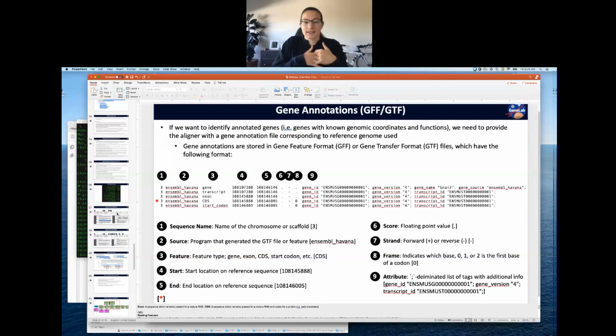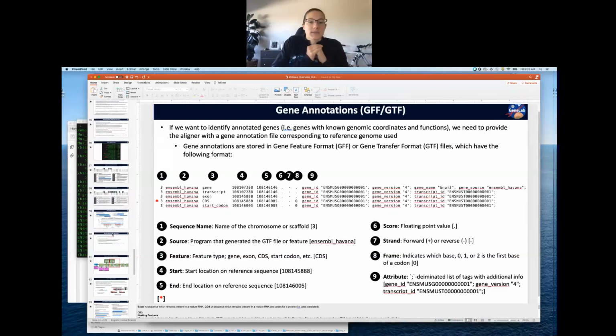Any guesses where we find that fragment length? Yes, Inru, the SAM file. And do you know what specific SAM file, since we're looking at isoforms and need to know the weighted isoforms? And of course, isoforms are the different transcripts that can be made from a gene.